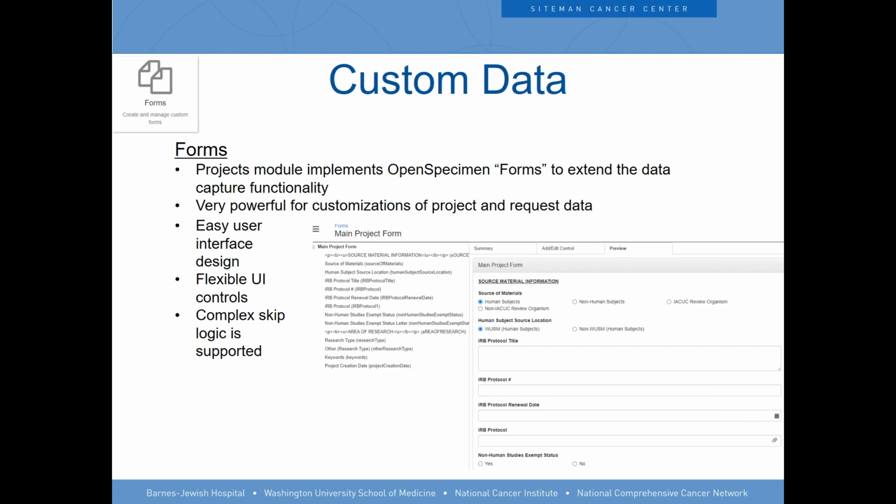And then we have a way of tracking the different statuses of the service. So if the service is still pending, if it's completed, or if it's not done, things like that. That's explained down here at the bottom too. So the actions that are requested to be performed on the specimens, and where they're done at the lab site, and things like that.